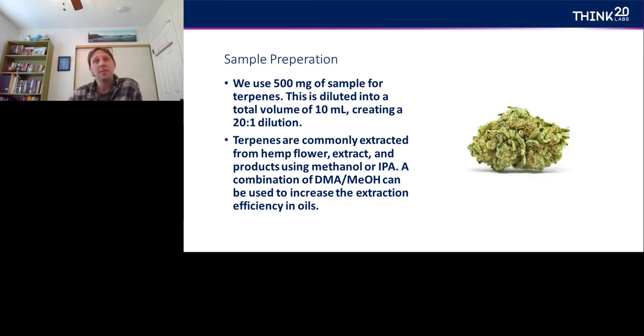Now for hemp, there is not federally mandated regulations yet, but we've seen a significant increase in what we call a full panel test for CBD and hemp products. So these are all the heavy metals and terpenes, residual solvents, cannabinoids. These are all the required tests for cannabis, but we've seen people becoming more and more interested in this for their hemp products. And the idea is that they are delivering a safe product to the consumer, which is really our end goal as well.